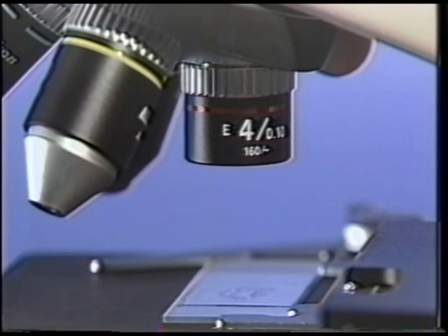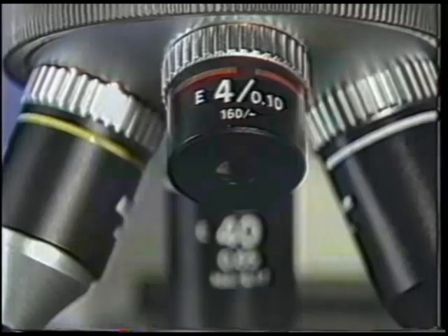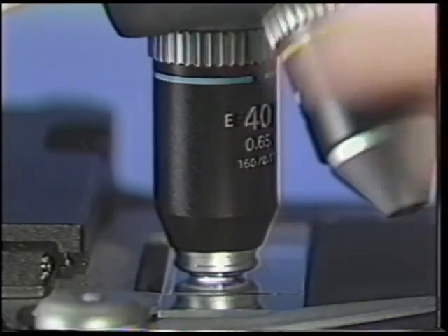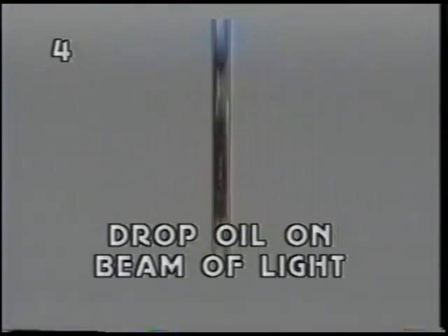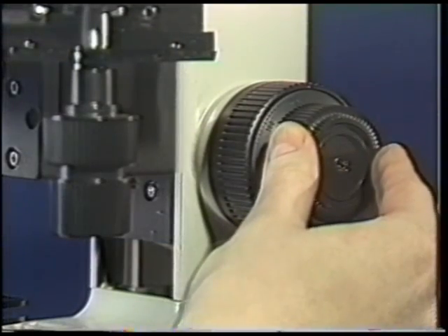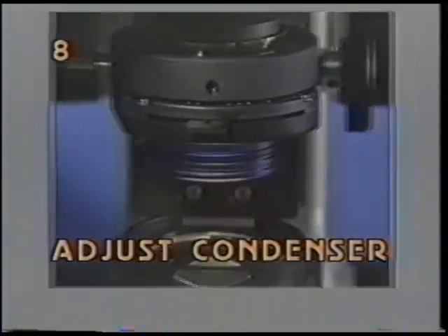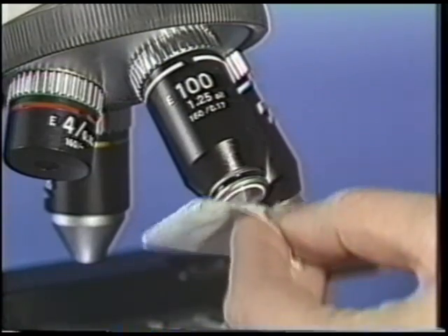Let's review the steps of oil immersion observation: 1) Select the viewing area with a 4X or 10X objective. 2) Narrow the field of observation with a 40X objective. 3) Rotate the 40X out of the light path. 4) After removing bubbles, drop an oil droplet on the beam of light. 5) Rotate in the 100X oil objective and move from side to side. 6) Fine focus. 7) Adjust the light intensity to a comfortable level. 8) Adjust the condenser diaphragm. 9) Observe the specimen. 10) Clean oil from the lens and slide.